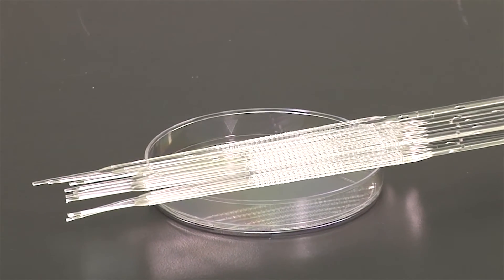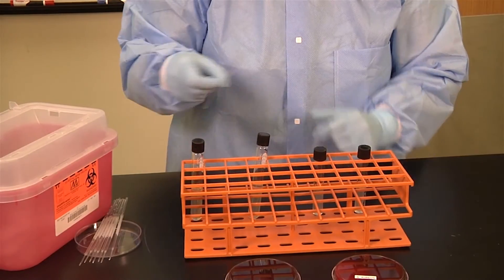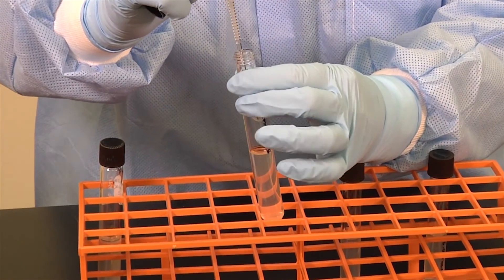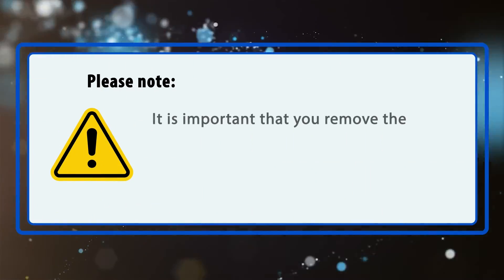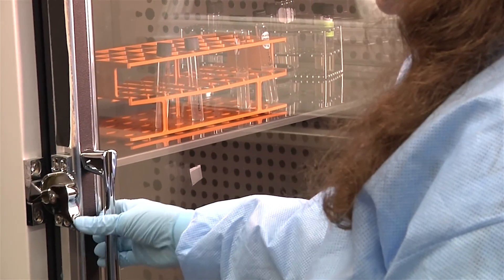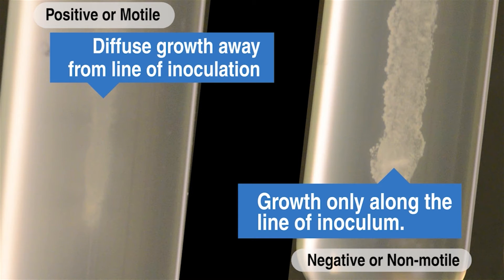With a sterile inoculating needle — do not use a loop, as it is too wide and will make results difficult to interpret — pick an isolated colony and stab the labeled tube medium straight down through the center to a depth of one half inch from the bottom of the tube. Do not go all the way to the bottom, as this prevents the organism from growing up the sides. Remove the needle along the same path used to enter the media, then discard it in the sharps container. Incubate at 35 degrees Celsius for 18 to 24 hours. A positive test in motility media without TTC is diffuse growth away from the inoculation site or turbidity of the media. A negative test shows only growth along the line of inoculum with clear media around it. Note that some organisms will grow better at the top of the tube where there is more oxygen.